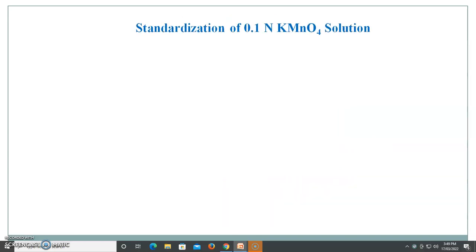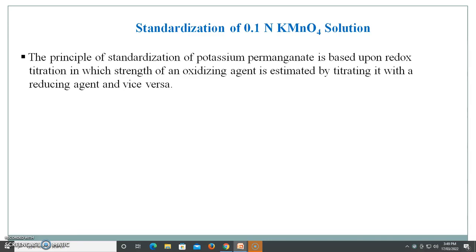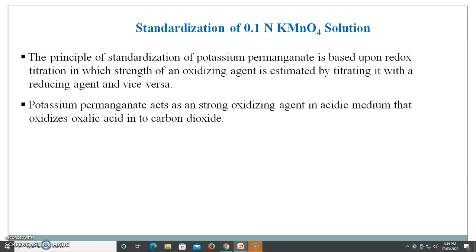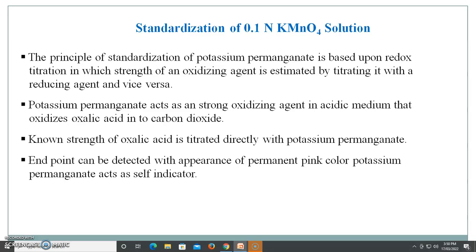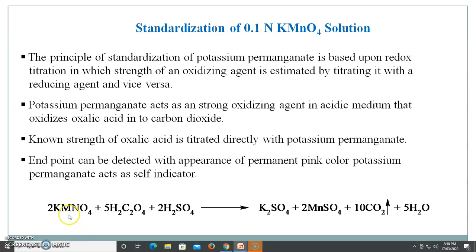Next, you have to standardize this prepared 0.1 normal potassium permanganate solution. The principle of standardization is based upon redox titration, in which the strength of an oxidizing agent is estimated by titrating it with a reducing agent and vice versa. Potassium permanganate acts as a strong oxidizing agent in acidic medium, oxidizing oxalic acid into carbon dioxide. The end point can be detected by the appearance of a permanent pink color. There is no need to add an indicator because potassium permanganate acts as a self-indicator. In the reaction, potassium permanganate reacts with oxalic acid in acidic medium, oxidizing it and liberating carbon dioxide.